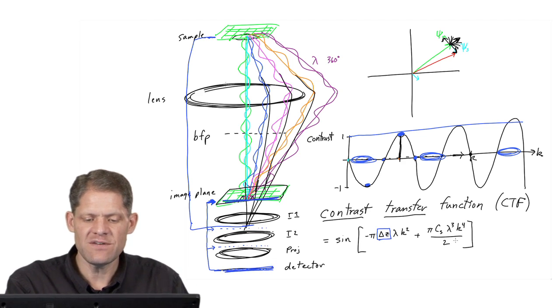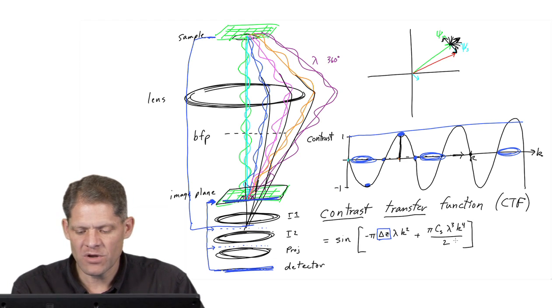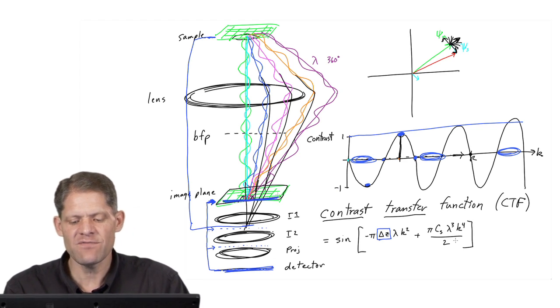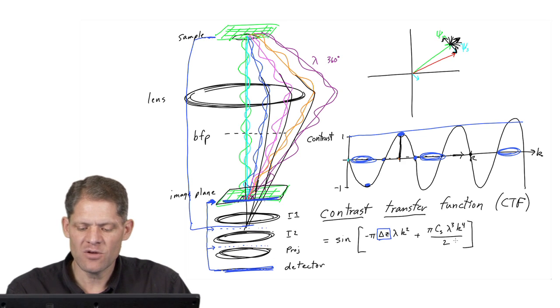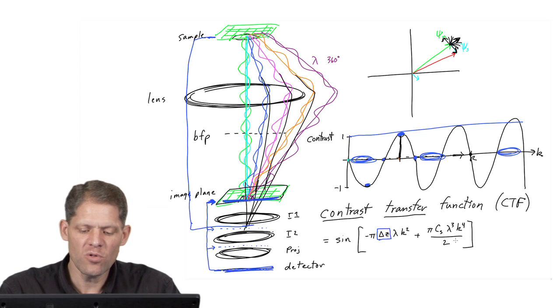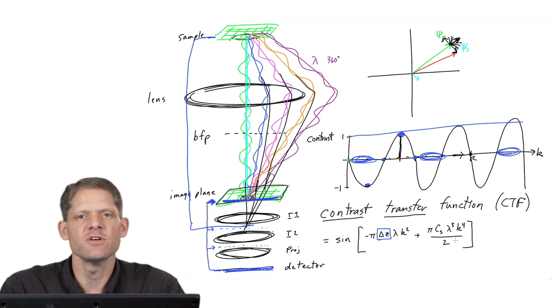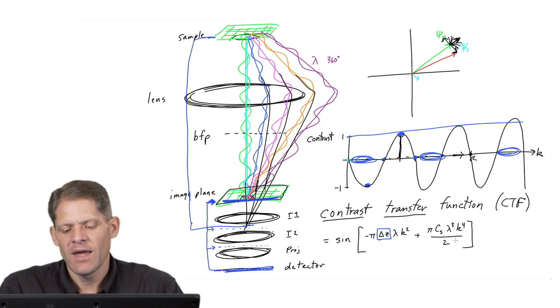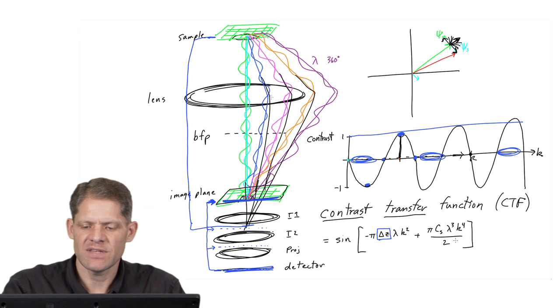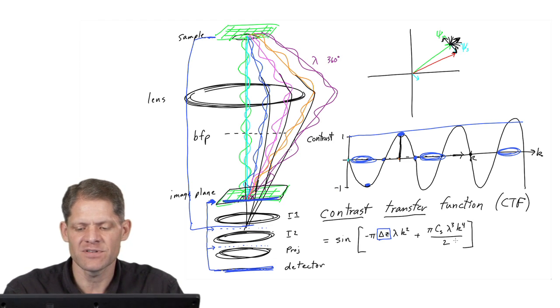And so if we defocus the objective lens, what we're going to record on the detector is a defocused image. It will be the wave function at this position. And because this position is no longer conjugate to the sample, we get an out of focus picture. And as you can see, because the angles of these scattered rays have all changed, so too will their path length differences.